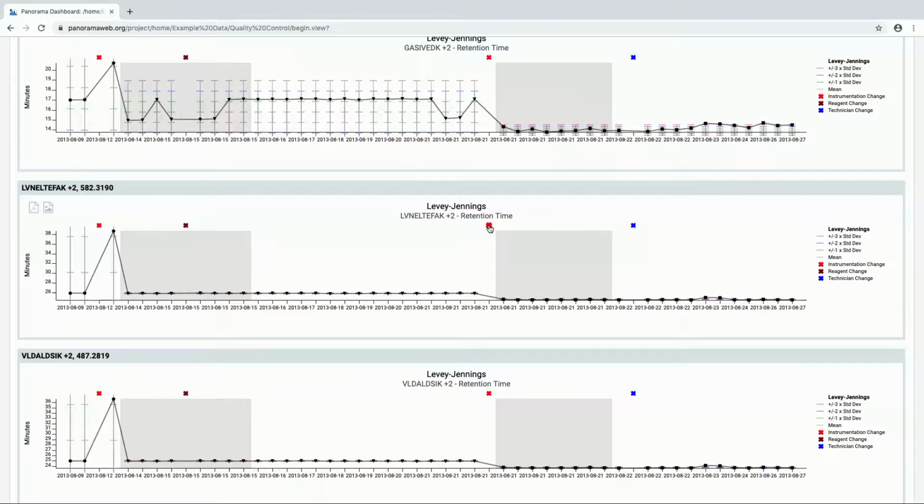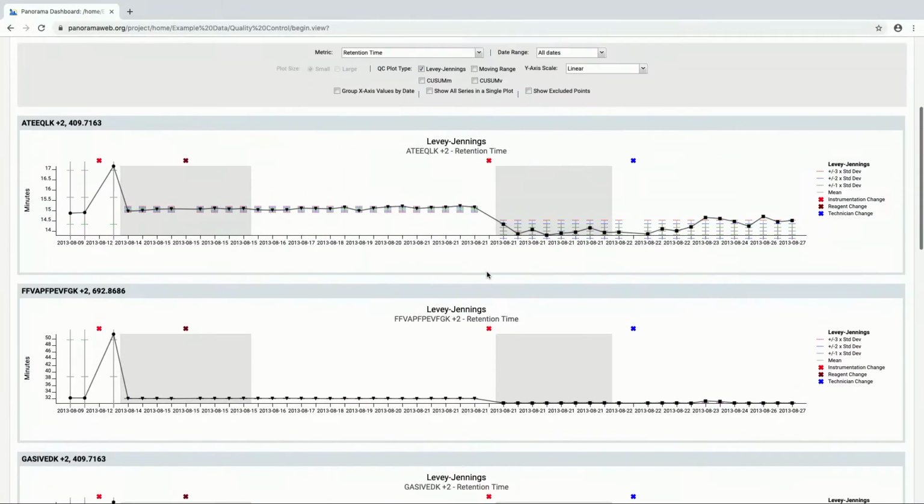Or you can say, something went wrong here. What's going on in my data? You track it down in the lab. Maybe your instrument needs cleaning. Maybe you ran out of your sample or it's degraded. Once you understand what happened, you can go back and annotate so that when you see the same trend next time, you can say, aha, that looks a lot like that. What happened before? Okay, now I've short-circuited a lot of that research.